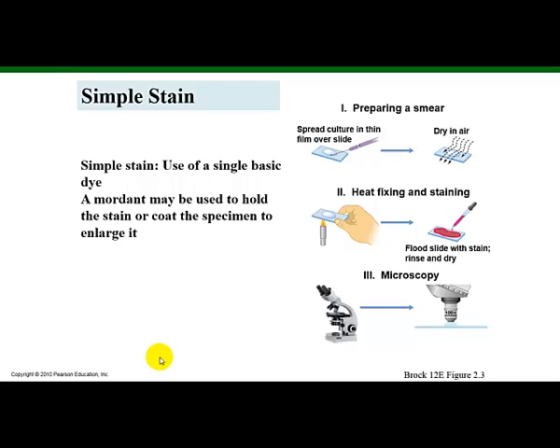But simply washing off the dye would result in removal of the cells along with the excess dye. So you've got to find a way to fix the cells to the slide before staining, in order to allow for removal of the extra dye while keeping the cells on the slide. A simple method is air drying the sample and then heat fixing it. The organisms are heat fixed by passing an air dried smear of the organisms through the flame of a gas Bunsen burner or putting it on a slide warmer.